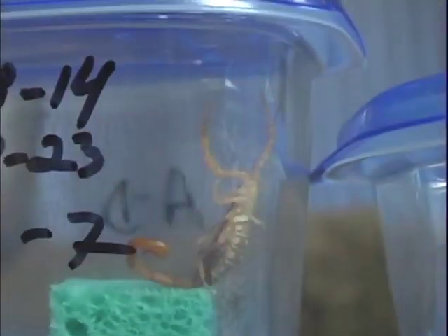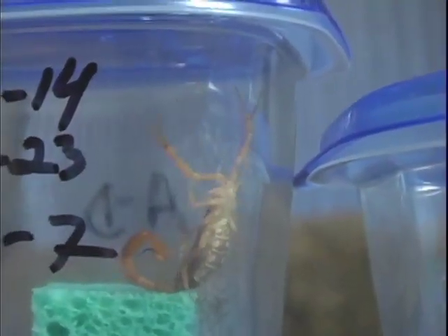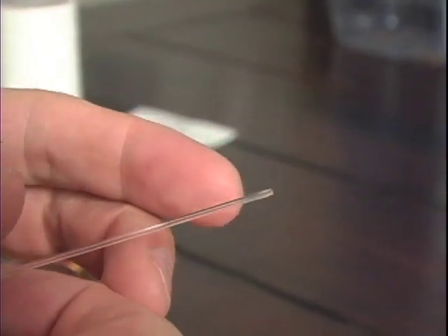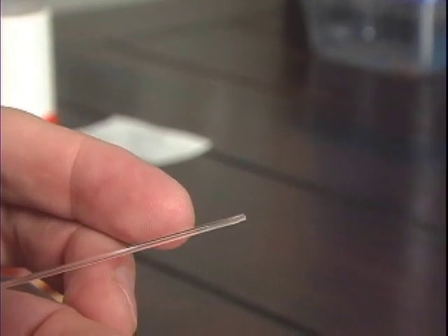To do my research, I had to milk each scorpion twice, three weeks apart. After being milked, a scorpion needs around two to three weeks to regenerate its supply of venom and a meal or two.